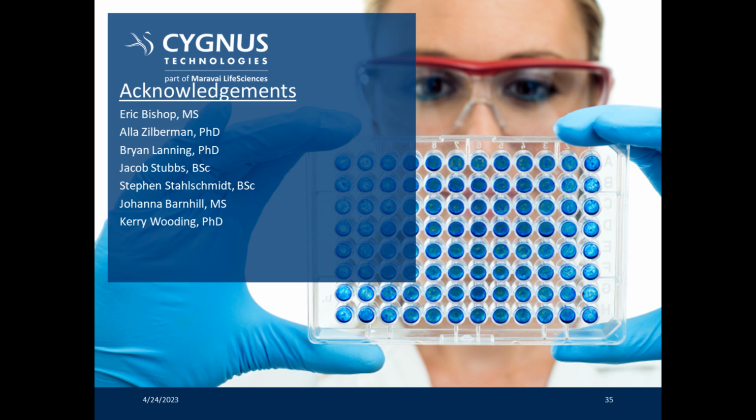And what is the protein concentration requirement for AAE-MS? Yes. So this is a little bit similar to the first question. So for AAE, we like a concentration of about 2 mg per mL and 20 mL. However, for AEMS, the actual requirement works out to be about 100 micrograms total of host cell protein.